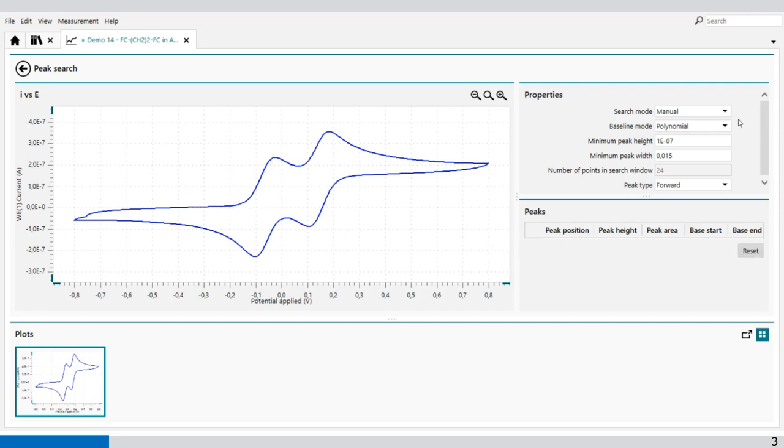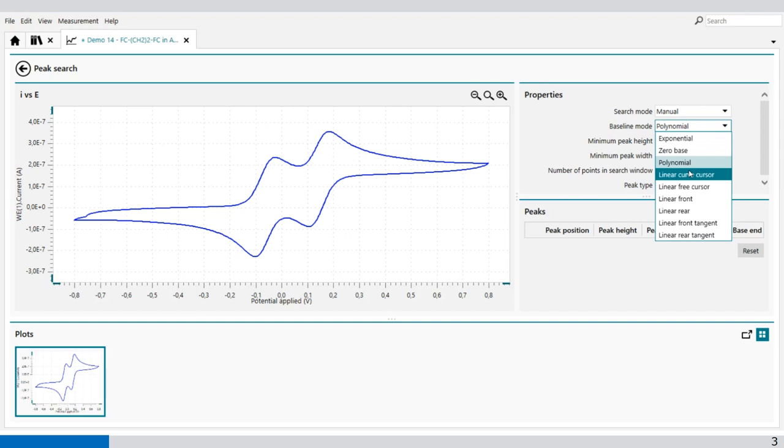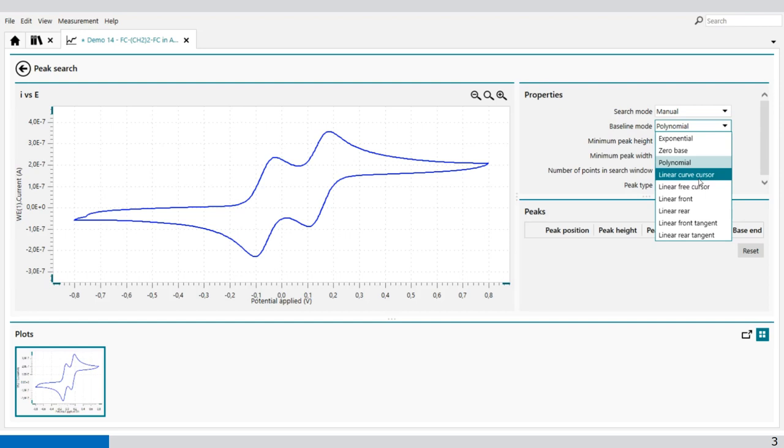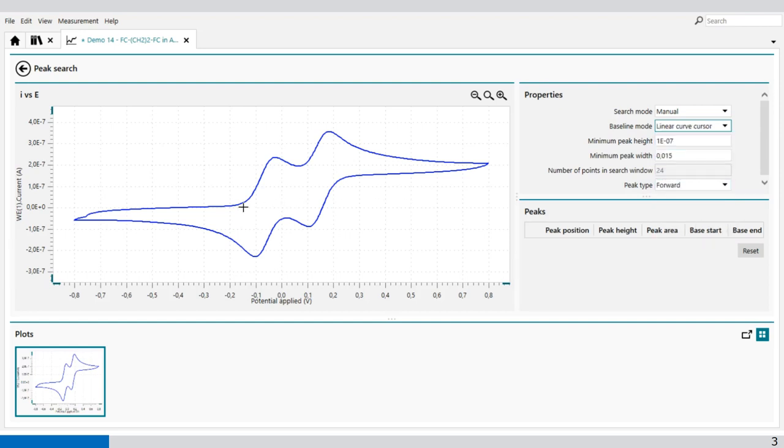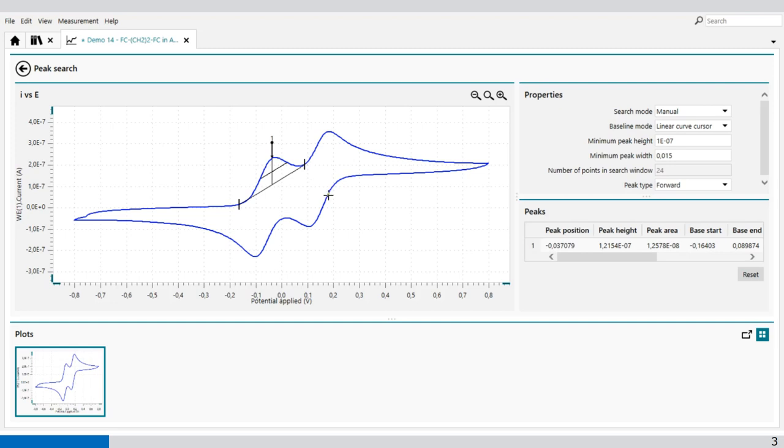We can reset it. Then we can have linear curve cursor. That's just a straight line between two points. For example, this point here to this point there. And again, peak position, peak height, and peak area.